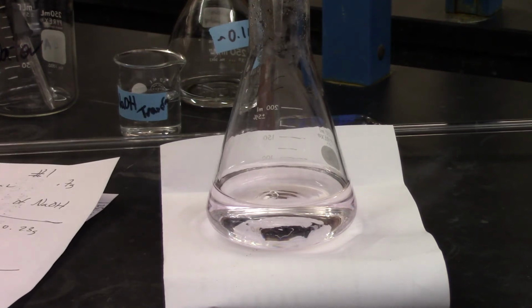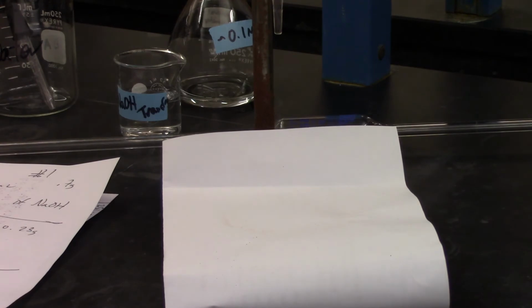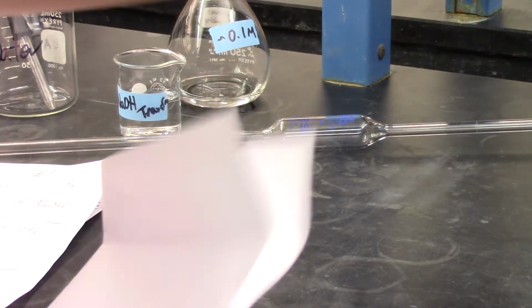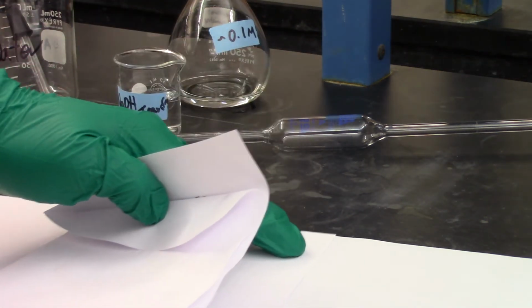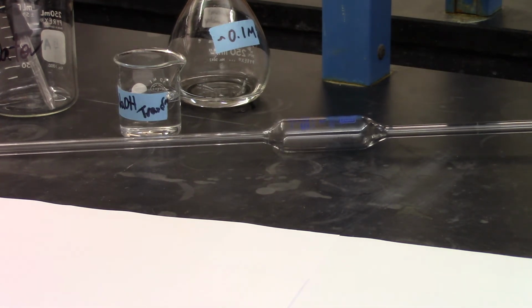Awesome. So now I've got my titration volumes. This is my third one. Now, I'm just doing this as an experimental for you. What you would want to do is go through these and do your rough calculations as you're titrating, because you're going to need 3 good titrations in order to crunch your data.